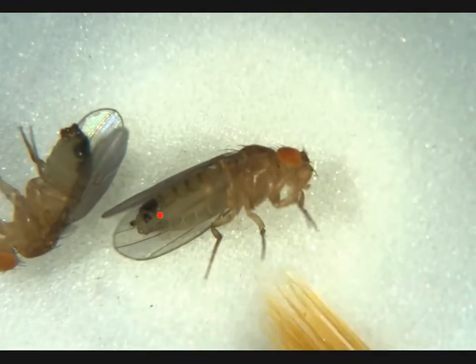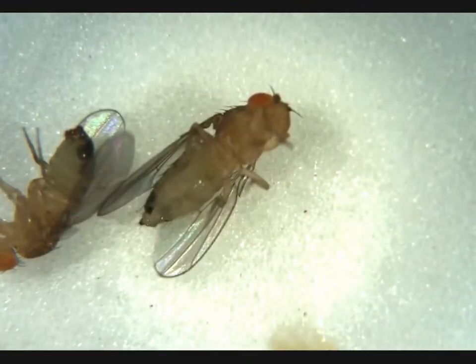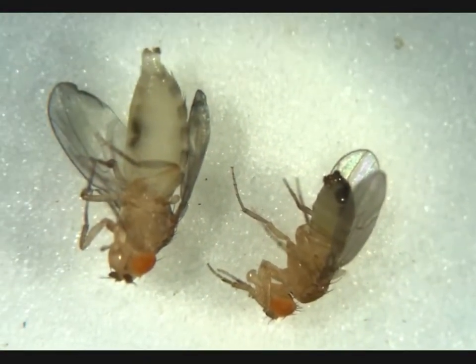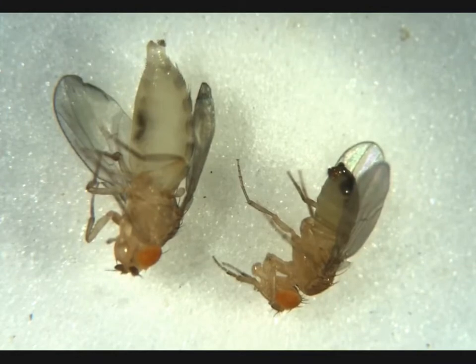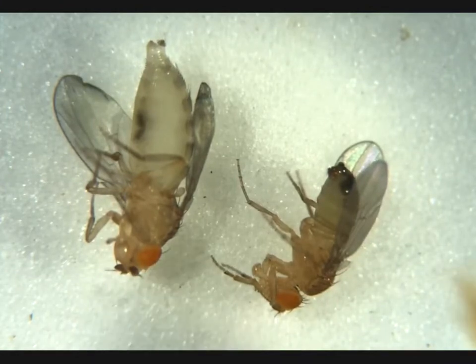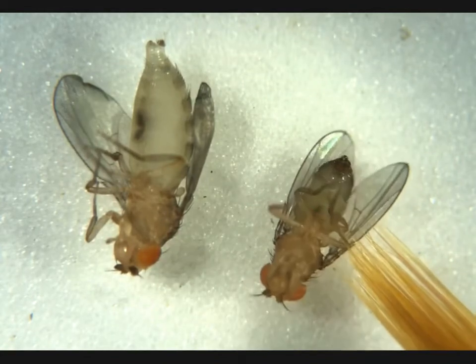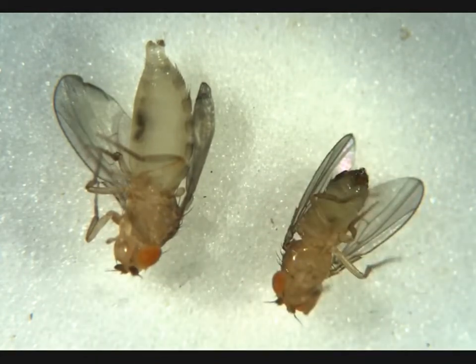Here we have a female. No penis apparatus, no visible meconium — adult female. Another male — penis apparatus here. We can see the difference in size between male and female here. He has a meconium that we can see right here, so he's a virgin male, but not what we're looking for.